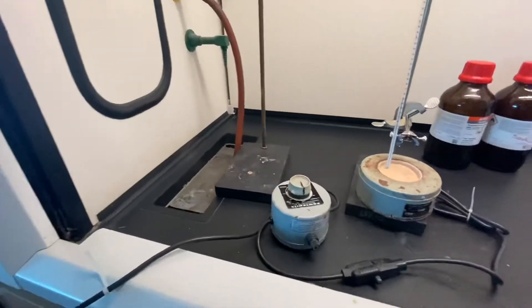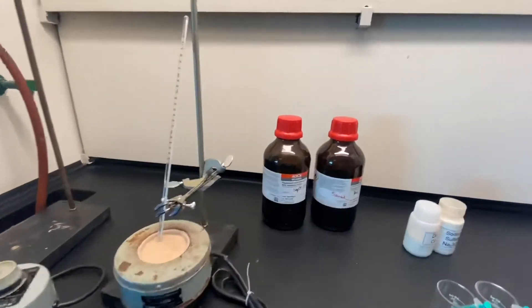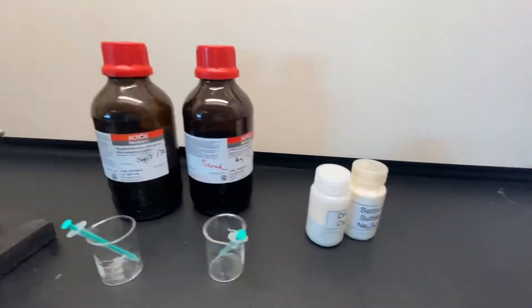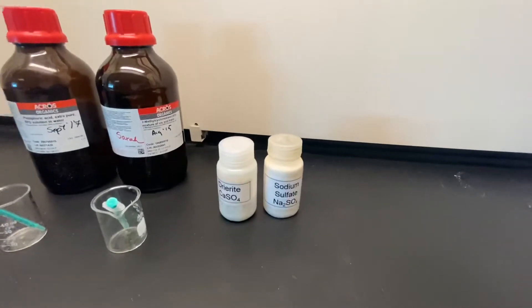Turn on your sand bath in the hood as soon as you come to the lab, with a setting of about 15 to 20. Your professor will indicate the location of all the materials that you will need for this experiment.